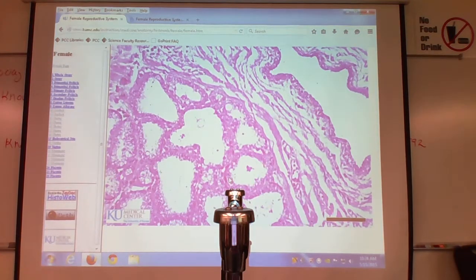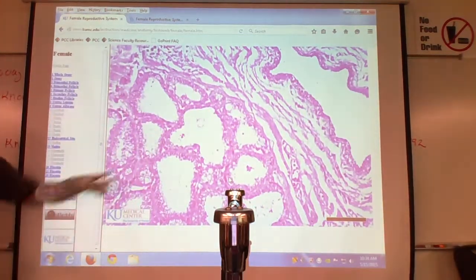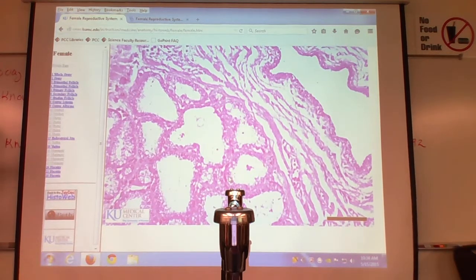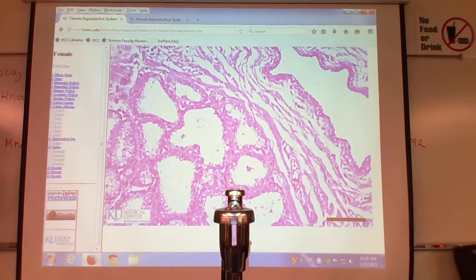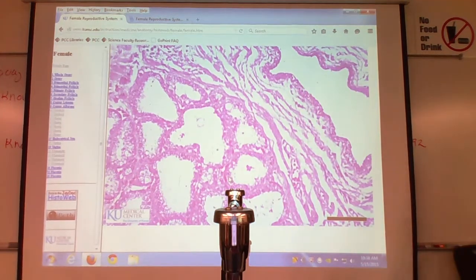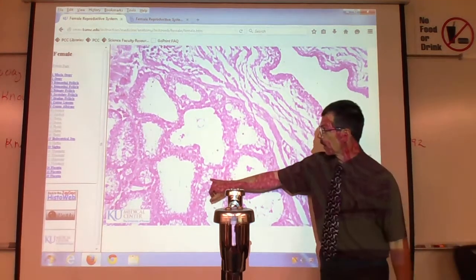They get really huge. Can anyone guess what this white stuff inside is? That's milk. So you're actually forming milk. The little circles just get bigger and bigger, so you expand what they call the alveoli. That's what's happening when you're lactating. So inactive and active, the gland's the same, it's just the size that changes. All these little white specks are the milk droplets you're forming.